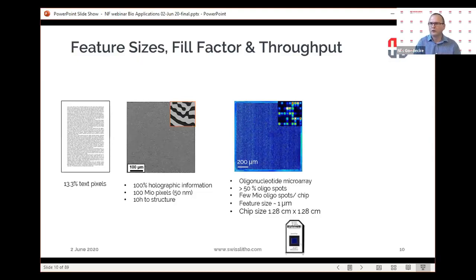They used to show all the details, so I put together what I could find out. So right now you have 6.5 million different oligos on top of a small chip the size of a fingernail, okay? But 50% is only used, because if you make the fluorescent dots too small, your scanner will have a hard time picking them up. So there is a limitation.